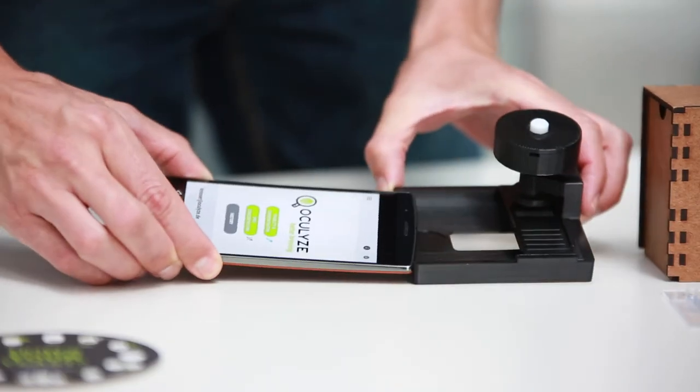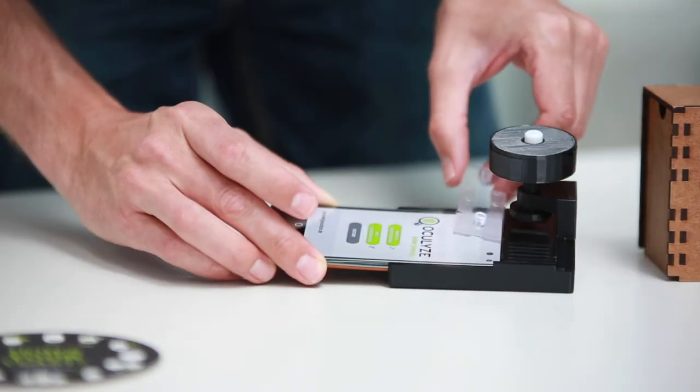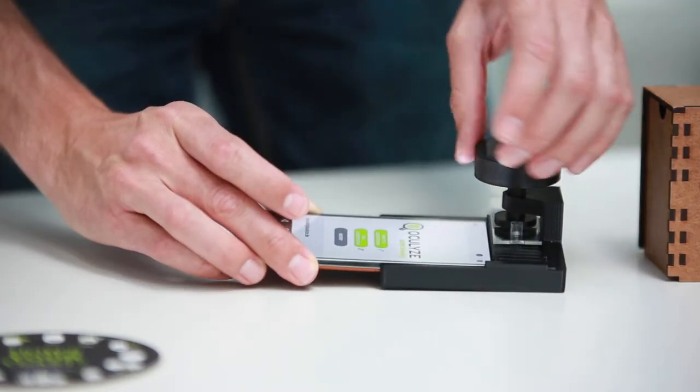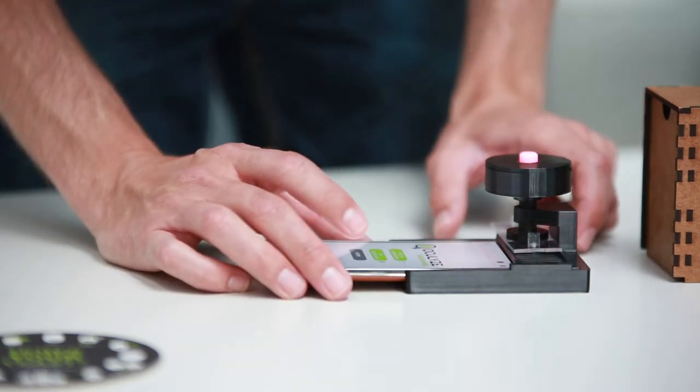Let's start measuring. Step 1. Slide the microscope into place over the mobile phone. Step 2. Insert the chamber and lightly screw it into place. Step 3. Turn the light button on the focusing knob on.